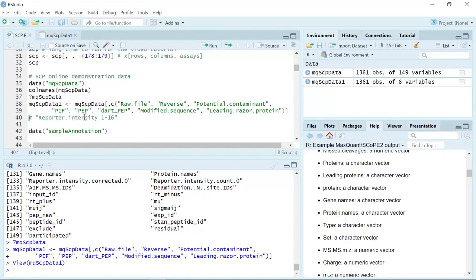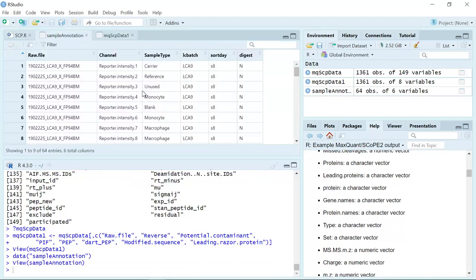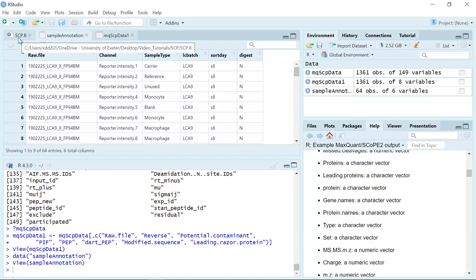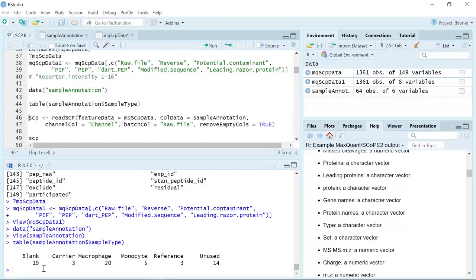In the data set we don't have the information about the channels and also the sample type, so they also prepare a sample annotation data set. We can load this next data set. If we inspect the sample annotation data set, you can see we have the raw files, the channel information, and the sample type. Now from both data sets we have all the information to analyze the single-cell proteomics data set. We can use the table function to have a look at the sample type. You can see we have 19 blank channels — the blank channels are the negative control channels that don't have any cells but were processed for the analysis.